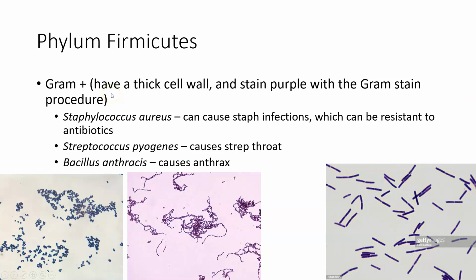All right. They have given you different pictures from what I have. Theirs are sort of like weird animated pictures, but here's how you would recognize each one of these individual organisms. It goes back to shape and arrangement. So notice that in this picture, all of the cells look like little teeny tiny balls. That means coccus. And they are arranged as clusters. There's a small cluster, here's a bigger cluster, and cluster is staphylo. So this is Staphylococcus aureus. This one occurs in chains, and we're still little ball shapes, and so this is Streptococcus pyogenes. This one is not ball-shaped, it's rod-shaped, so that's a bacillus, so this is Bacillus anthracis.